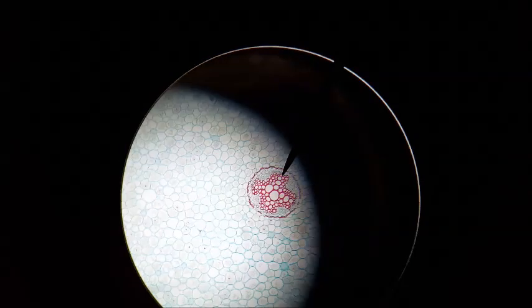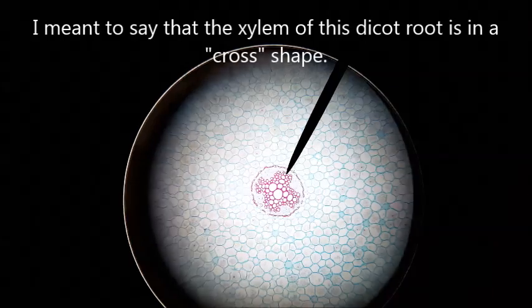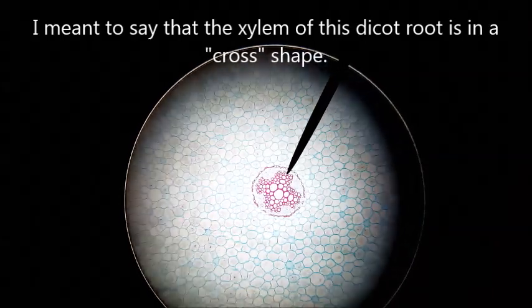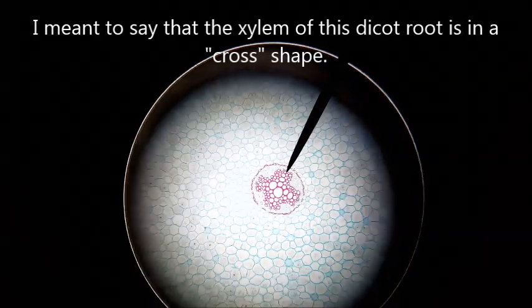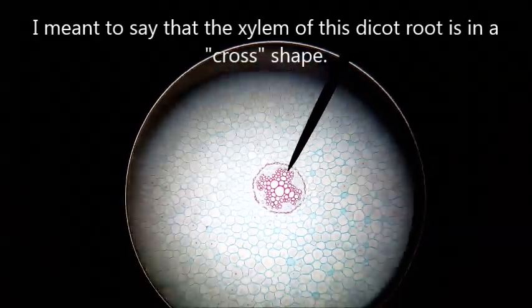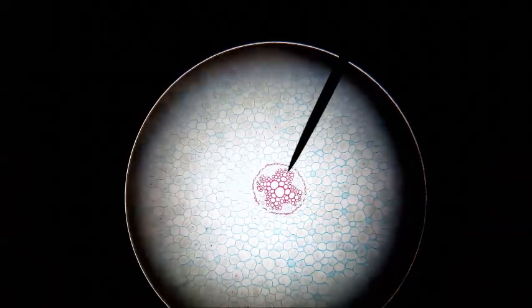In this 100x magnification, the dicot root of this ranunculus is in a cross shape. The reddish center cross is the xylem. Between the arms is the phloem and then the ring is the endodermis.